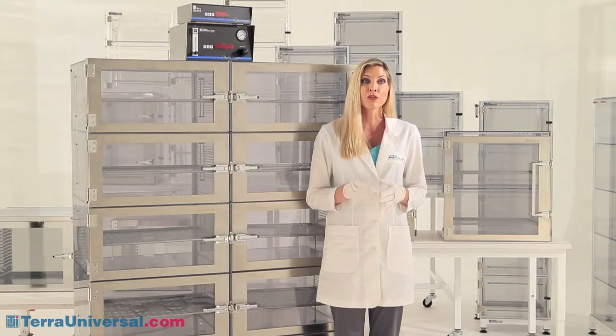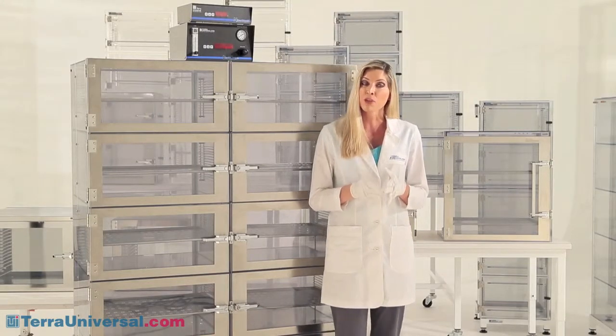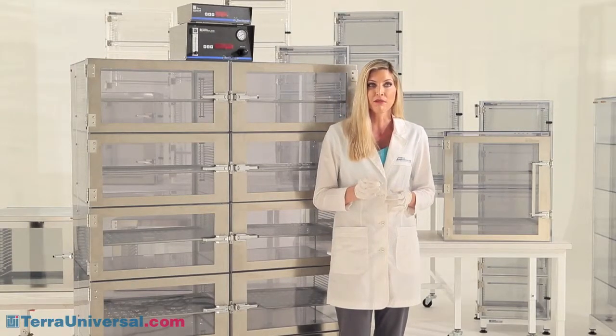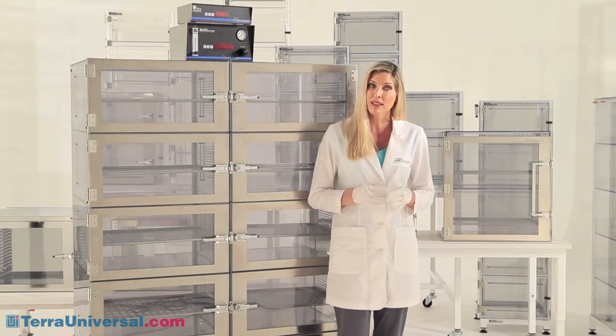Ports are provided for introducing nitrogen, monitoring the internal pressure, connecting the optional NitroWatch humidity sensor, and installing Terra's relief bleed valves. Normally, you add one of these valves to each chamber, ensuring that displaced air quickly exits the cabinet.